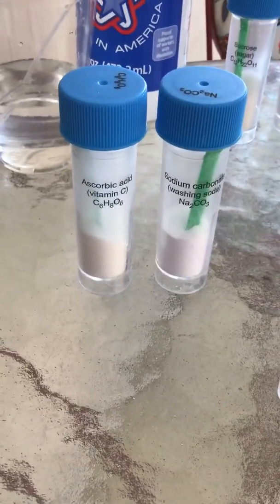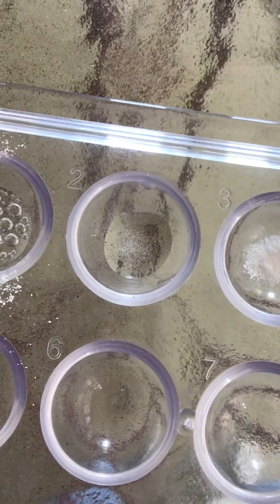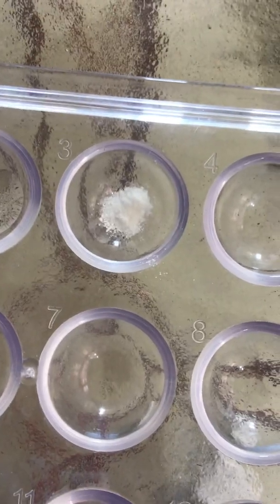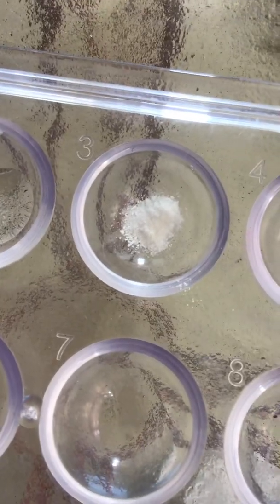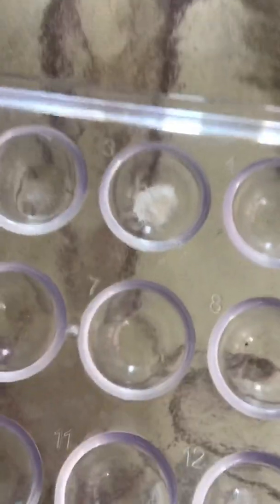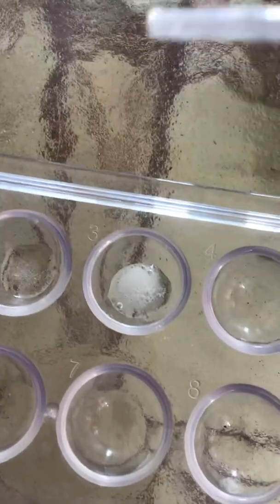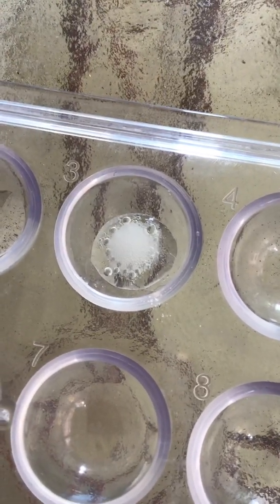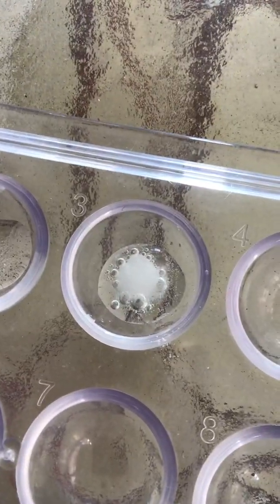Next I'm going to try ascorbic acid and sodium carbonate in well three. The citric acid and sucrose look like they're starting to dissolve or come closer together. In well three, I put in ascorbic acid and sodium carbonate. It looks kind of flaky and powdery together. Let's see what happens when I add the water. It's definitely fizzing much more. It does have bubbles, but the fizz is a lot more than what we saw in the beginning.